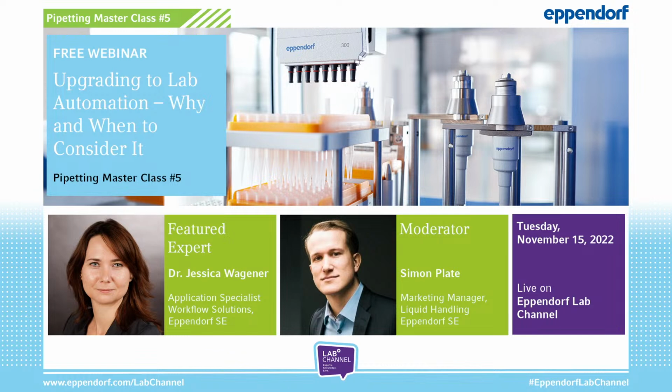Today's topic is upgrading to lab automation, why and when to consider it, and we'll take a closer look at pipetting robots. In the next 30 minutes, we'll cover the following points. We'll share our view on general benefits of lab automation. Then we'll take a closer look at liquid handling workflows to see where the use of pipetting robots might be beneficial. And we are going to find out if automation can also support low throughput applications.